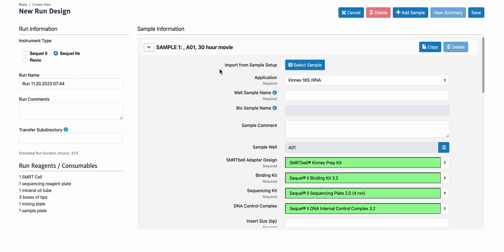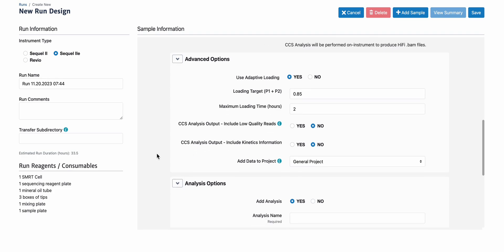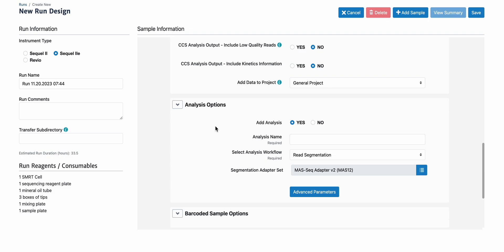Let me show you what this looks like for Kinnex 16S on Sequel IIe. There's a typo I want to point out — as of this video recording, the on-plate concentration shown is incorrect; it should be 40 to 60, as you saw in sample setup. Hopefully by the time you're watching this, the typo has been corrected. We'll leave the default options here. For auto-analysis, we don't support secondary analysis for 16S, only read segmentation, so you will use the auto-analysis read segmentation. The Kinnex 16S is a 12-fold concatenation kit, so we'll choose the MAS-Seq adapter v2, MAS12.